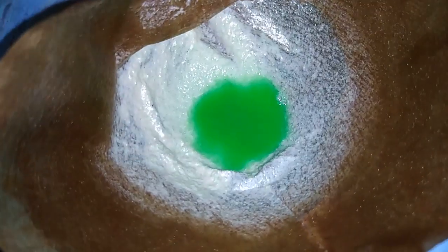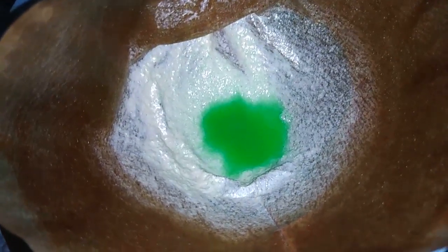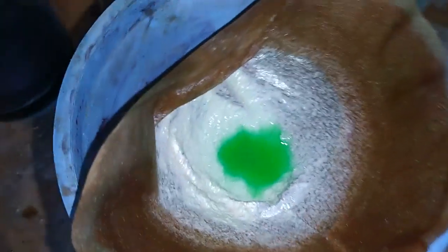Okay guys, you see that? This is silver chloride from this little fuse. The filtration step is still going on.